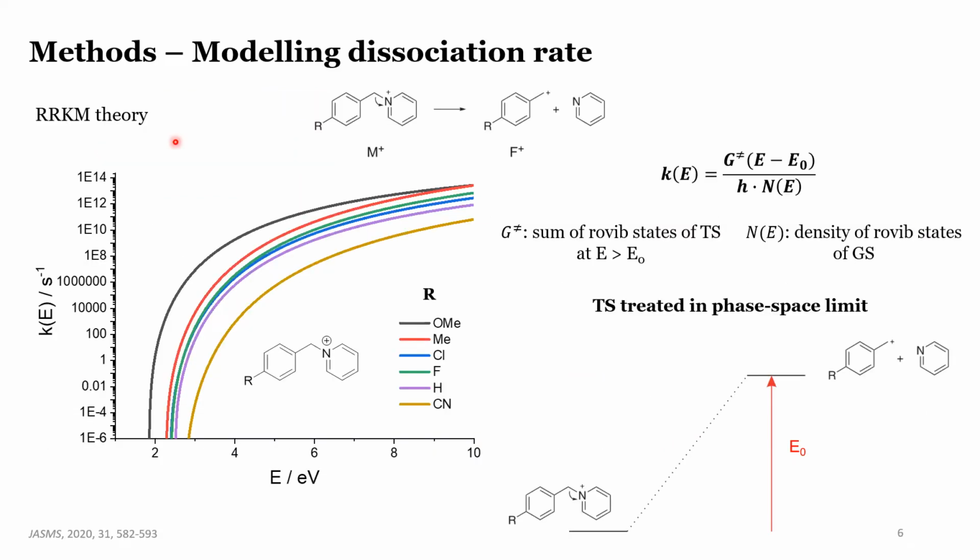So to begin, characterizing ion effective temperatures requires some sort of chemical thermometer. To do this, we indirectly measure ion temperature by monitoring the degree of fragmentation of so-called thermometer ions, of which the benzylpyridinium species have long been used. Effectively, these species undergo a unimolecular dissociation that releases pyridine and a substituted benzyl cation. In the energy regime of the DMS cell, fragmentation of these species stops after this unimolecular decomposition, so evaluation of ion temperature doesn't become convoluted with competing fragmentation pathways.